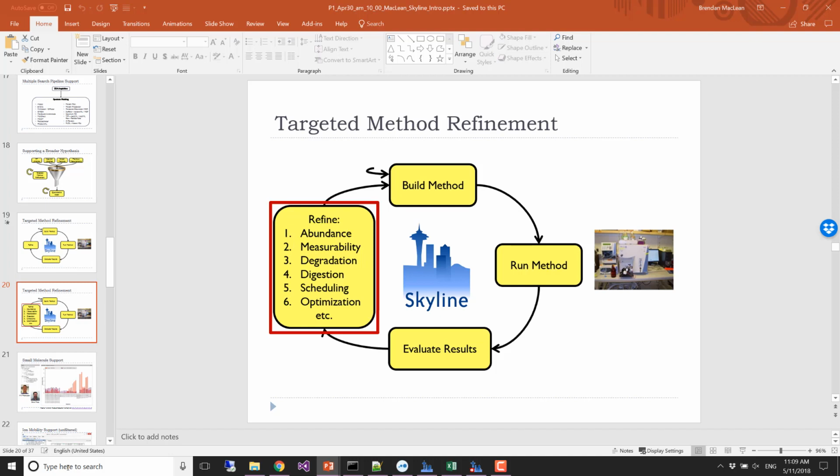Because one of the things that they did was they did this really exhaustive fractionated DDA library. They also did these replicate measurements. Based on what I'm seeing in the MacCoss lab, I decided, well, let me see if I give Mina a document where it's only got the peptides that are highly reproducibly measurable in the replicates. There are 8 runs that are supposed to be technical replicates, so I should have very low CVs in those.